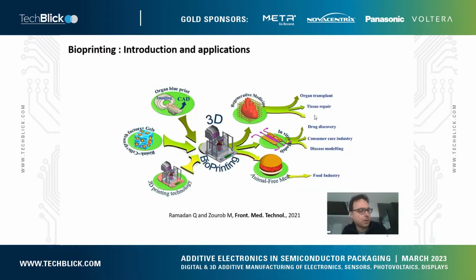I will spend a bit more time on introducing the topic, because even if it is additive manufacturing, it might not be in the immediate research field of many of you. When we're talking about 3D bioprinting, we are essentially meaning preparing bioinks that include gels, growth factors, and living cells, and using bioprinting machines to create living constructs that recapitulate functions of our body.